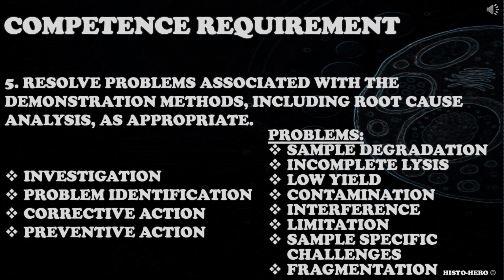Consider possible problems with sample degradation like thermal, enzymatic or oxidative, incomplete lysis, low yield, contamination, interference, technical and methodological limitations, sample-specific challenges like fatty or tough tissues, blood contamination, fragmentation of genetic material.